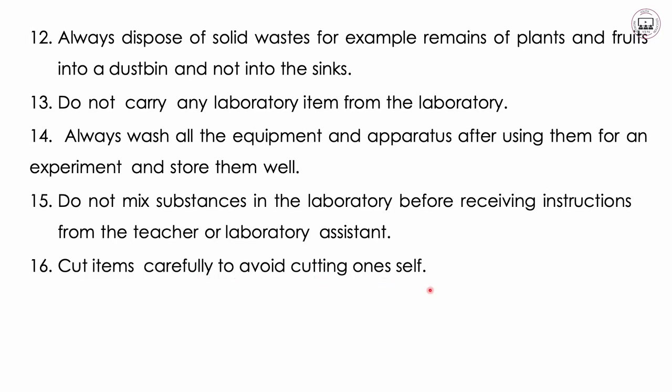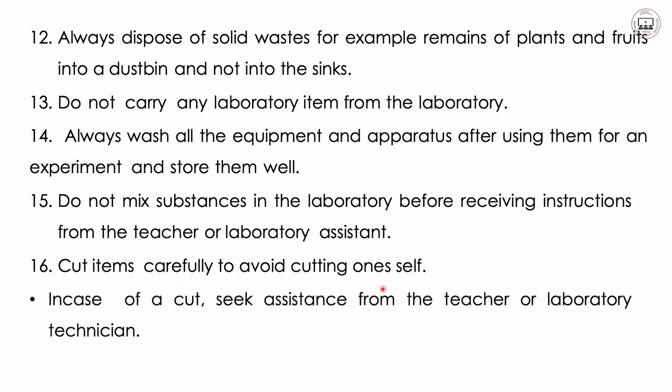Now, 16, cut items carefully to avoid cutting oneself. You'll be using scalpels, razor blades. When you are cutting the materials, cut them carefully to avoid cutting yourself. Then you should also understand, in case of a cut, seek assistance from the teacher or laboratory technician.